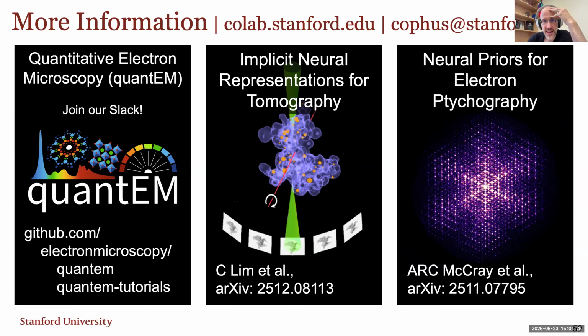Yeah, so Shantanu is asking, in the pixelated FFT in the notebook, there's 4 spots in high frequency zones. Are they an artifact? Yeah, it's probably a detector readout artifact. With a little bit of filtering, I'm sure we could remove it. That's definitely an artifact.